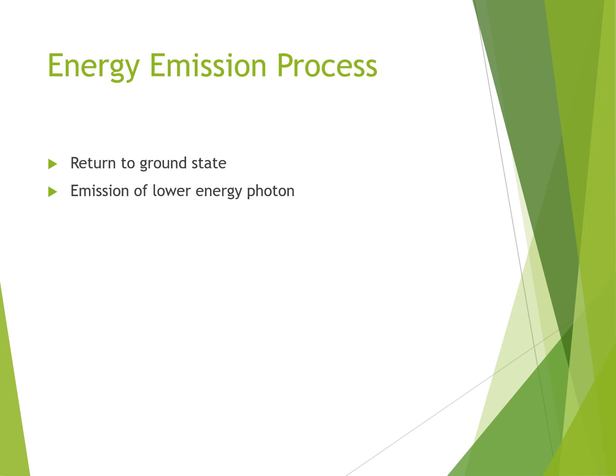Now we will discuss the energy emission process in detail. Before emitting light, the molecule loses some energy as heat through vibrational relaxation. As a result, when emission occurs, the photon has lower energy and longer wavelength than the absorbed photon.